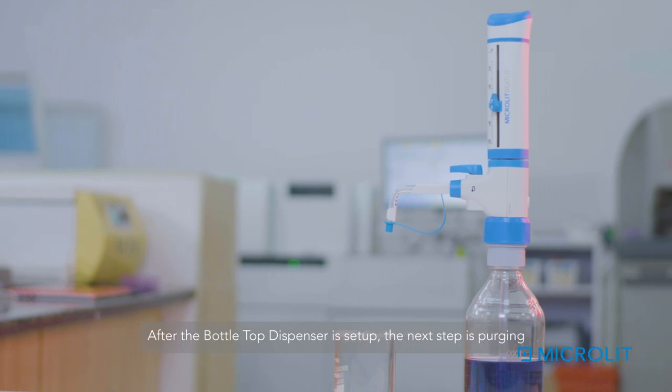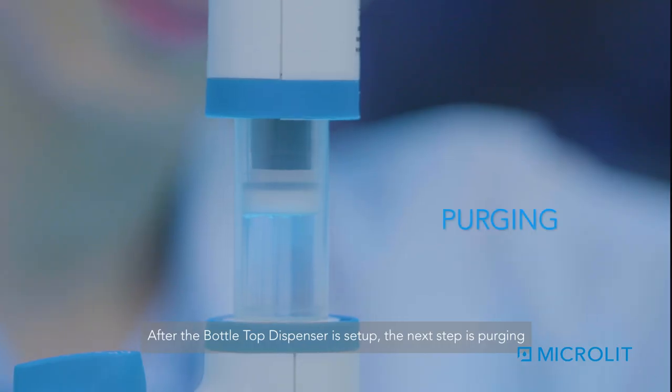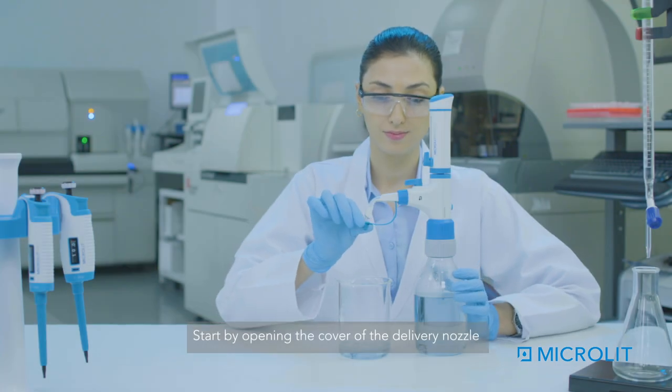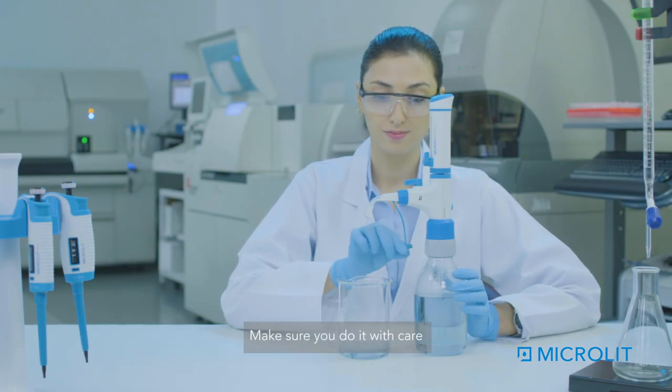After the bottle top dispenser is set up, the next step is purging. Start by opening the cover of the delivery nozzle. Make sure you do it with care.